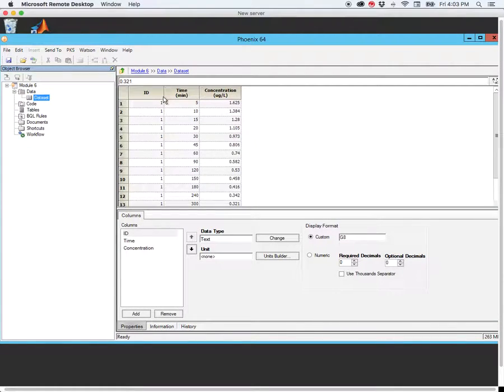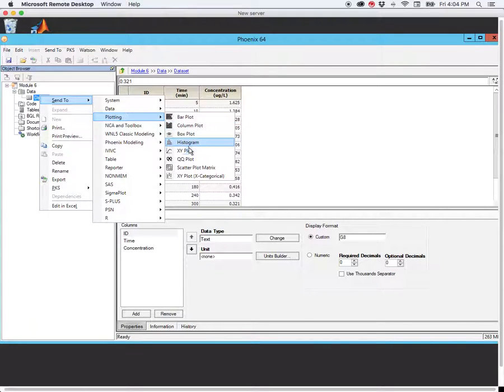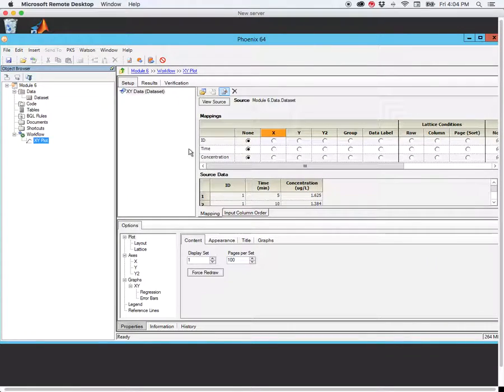We have a data set from one animal, and it's a typical time in minutes. Often these data sets are time in hours, but in this case it's time in minutes. We have our concentrations in this column, and we have our units, which is important because that helps us determine the units of our parameters as well. The first step is always to plot your data with a simple XY plot. This helps us get a sense of what our data looks like, and also to make sure there haven't been any mistakes in our data entry, because if there were mistakes we may get funny outliers or the shape of our time concentration curve just doesn't look right.